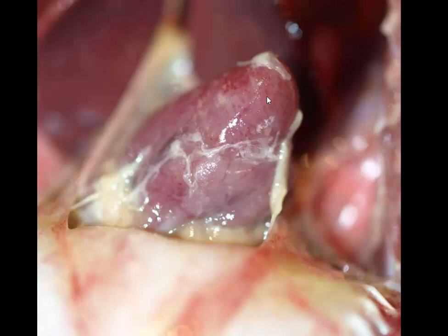If you look really closely, you are going to see little areas of hemorrhage, probably the source of this fibrin. Morphologic diagnosis would be a diffuse fibrinous epicarditis with hemorrhage.